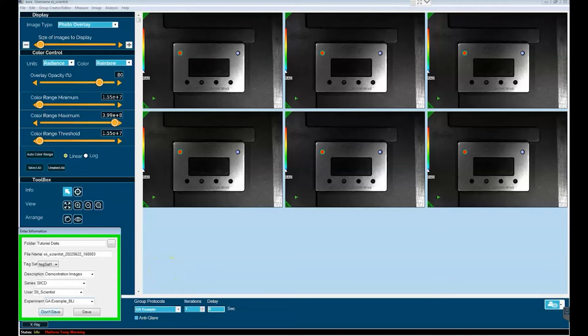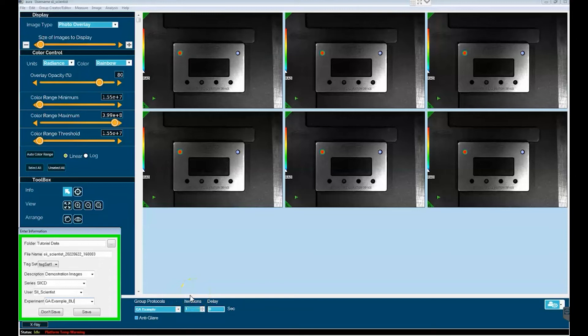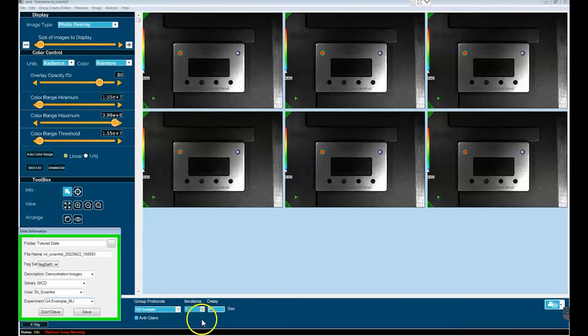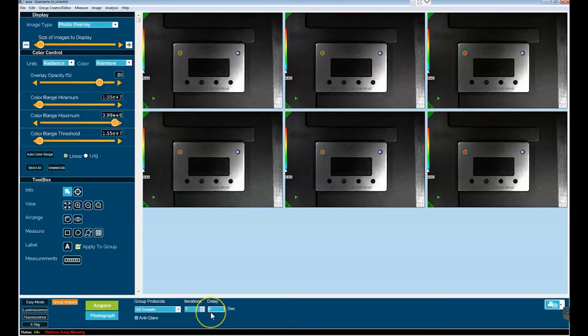Now one final note on group acquire is that you obviously have the option to do multiple image acquisitions. In addition to that you can do multiple iterations of an individual group acquire protocol. So if I wanted to run these set of six images more than once, let's say to guarantee that I caught peak bioluminescent data, I could make the iteration value greater than one. I could increase it to two, three or whatever value I chose. And I could put a delay feature in the running of each iteration.